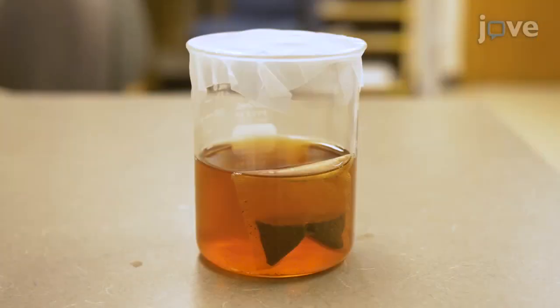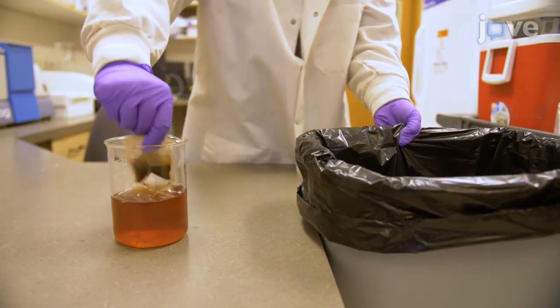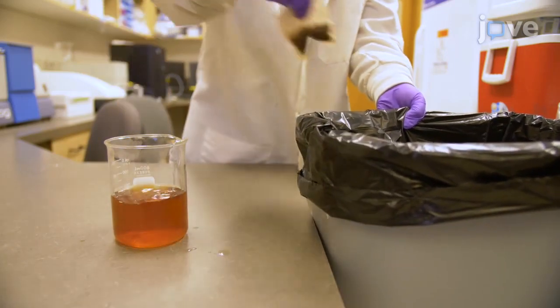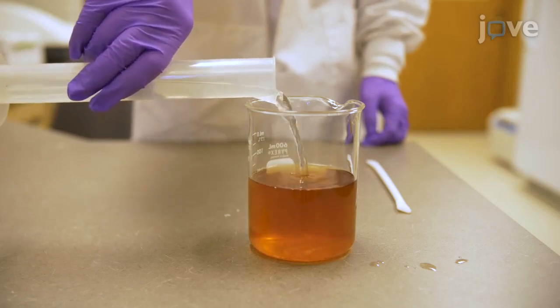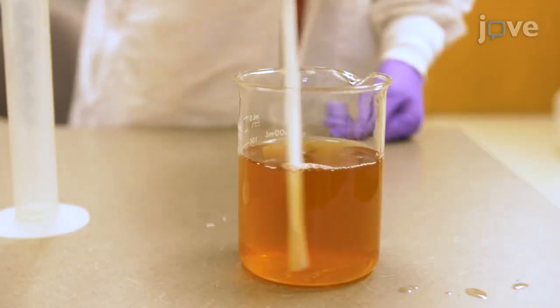Steep a bag with 2.54 grams of black tea in the flask containing sucrose solution for one hour. Remove the tea bag with the stir rod without breaking it open and dispose of it in the trash. Add 100 milliliters of distilled white vinegar to the beaker and thoroughly stir the mixture.